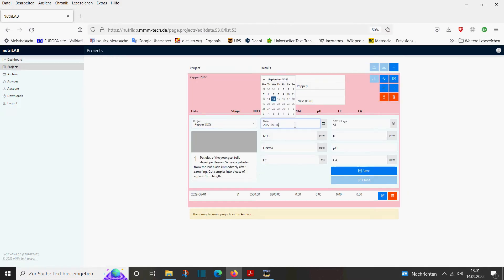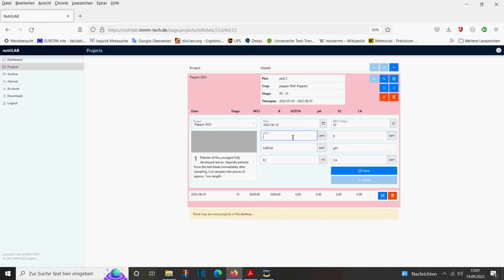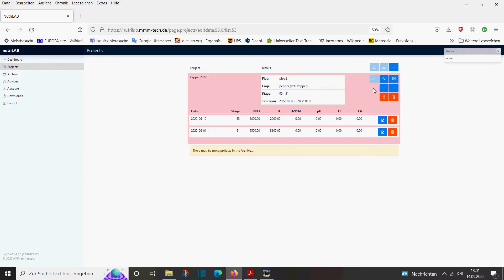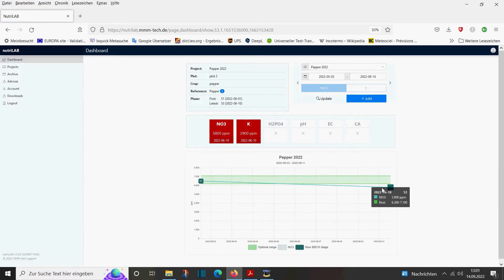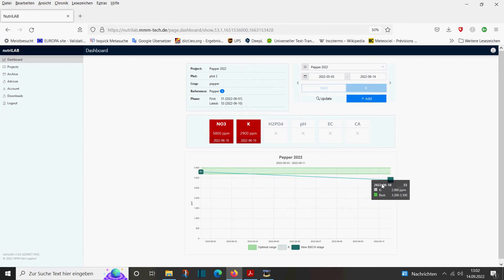After 10 days we take the next measurement. We have reached BBCH stage 53 and measure 5,800 ppm nitrate and 2,900 ppm potassium. We save and control it. We see that for both nutrients we are a little bit under the optimum range — the tile is red. We have 5,800 ppm but should have at least 6,200 ppm for nitrate, and 2,900 ppm potassium where we should have at least 3,200 ppm. Therefore we know we have to increase the fertigation a little bit.